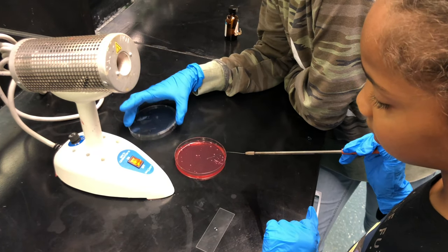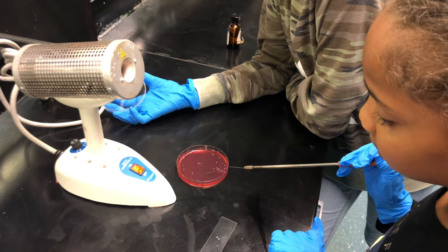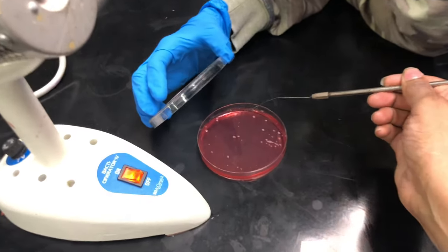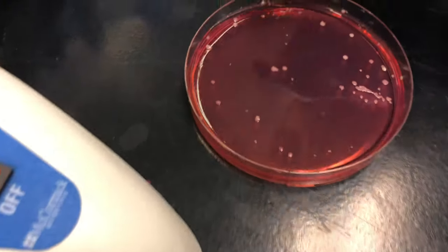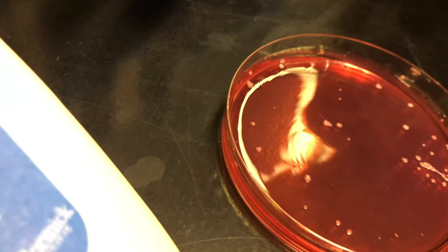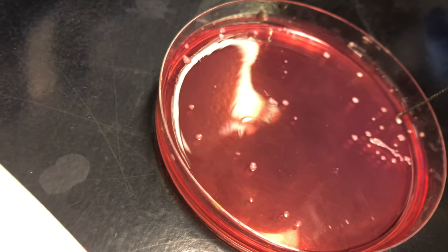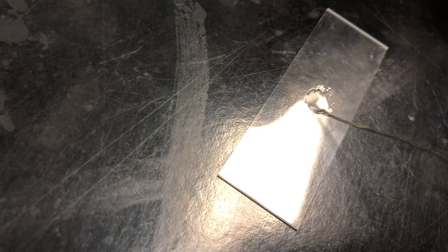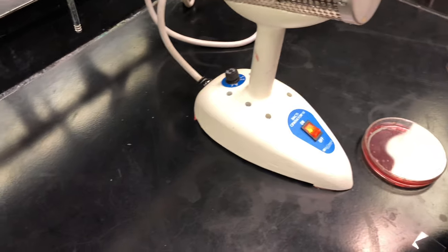Jasmine, don't put the plate lid on the table — keep it over the plate to avoid contamination. Which colony do you want to use? Use the dark one. Just barely touch it — all right, I'm gonna close the plate. Spread it out and let it air dry, then heat up the loop.